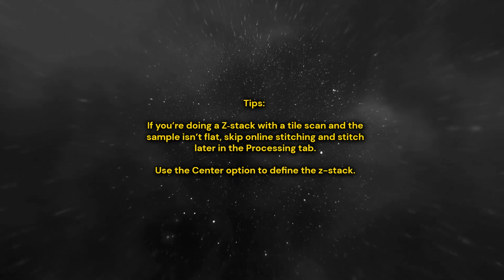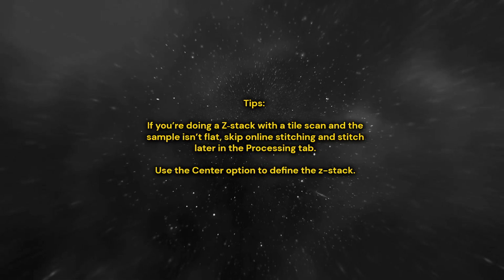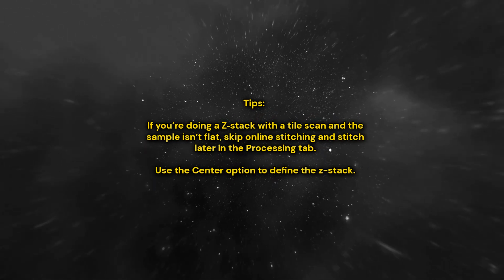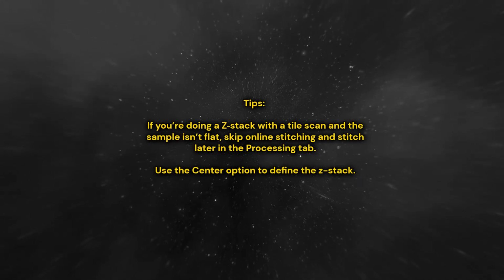Here are some tips. If you're doing a Z-stack with a tile scan and the sample isn't flat, skip online stitching and stitch later in the Processing tab. Use the Center option to define the Z-stack.